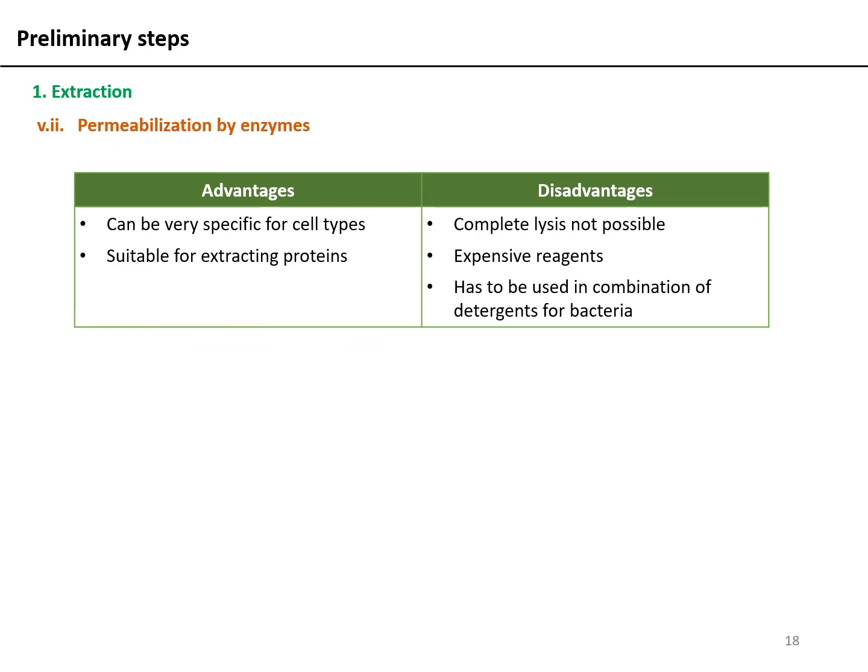Also, say for instance within bacteria, if you're using different strains, then different strains might sometimes require different methods of cellular lysis. So in order to obtain efficient cell lysis, the first step would be to always optimize the conditions that are best suited for a particular system and, within the system, for a particular protein. Most commonly, from experience I can say that generally not any one of these methods is used for cell lysis, but rather a combination of different methods.